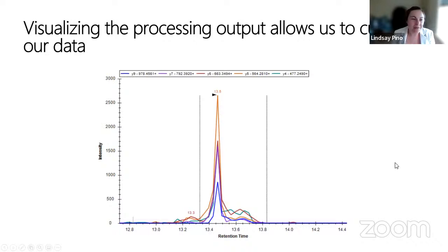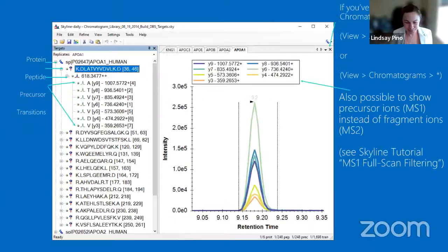This is an example of a pretty decent looking peptide. We're going to look at some more crazy ones with Brendan tomorrow and Wednesday. Just kind of orient you.